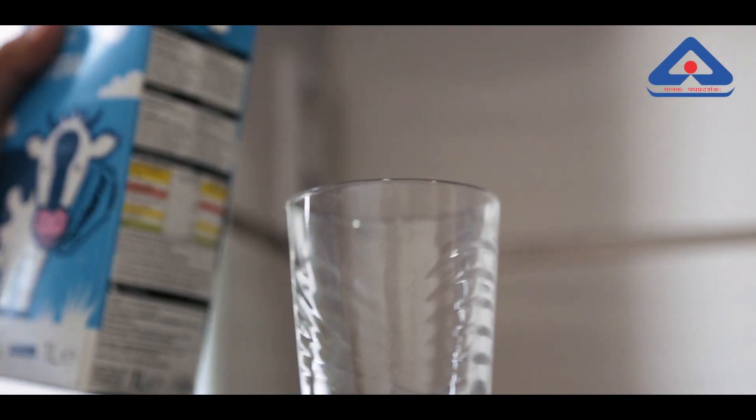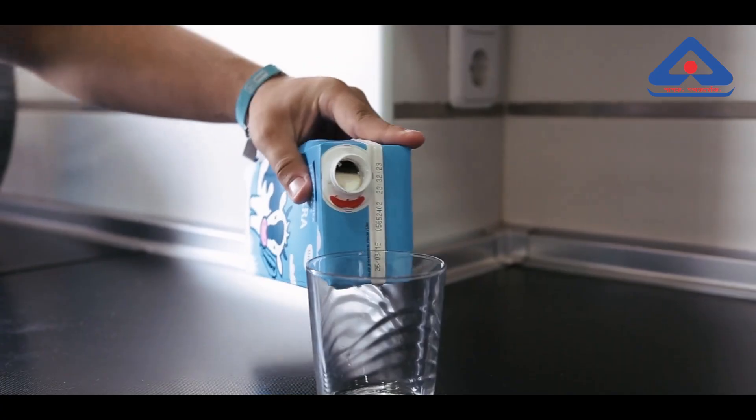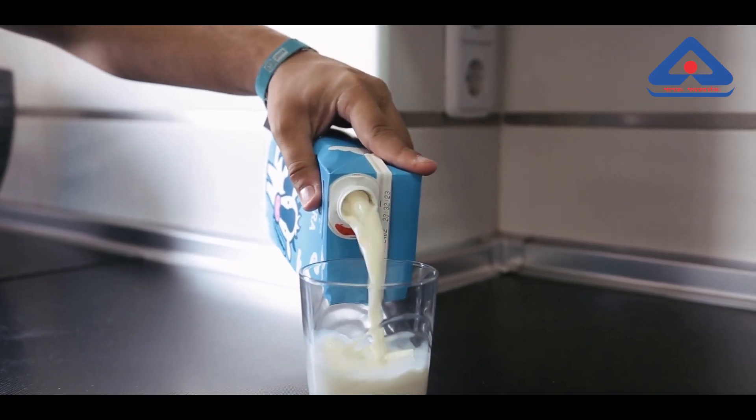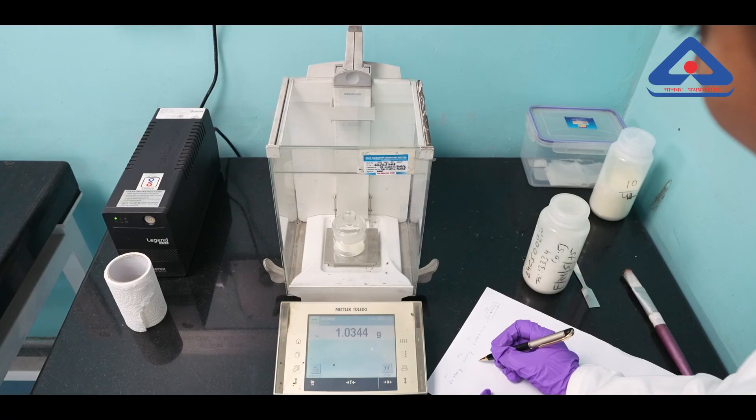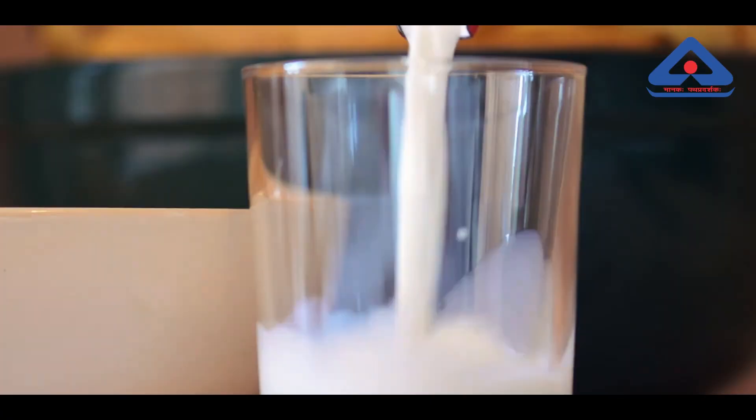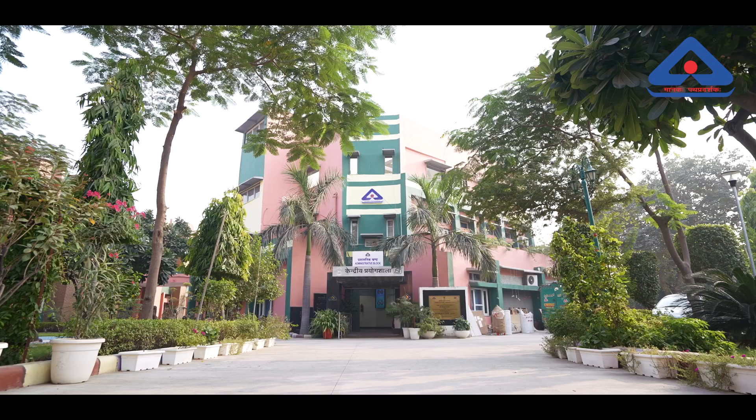Today we are diving into an essential dairy product you might find on your kitchen shelf: skimmed milk powder, or SMP. This video will show how skimmed milk powder is tested to ensure it's safe for us to consume.